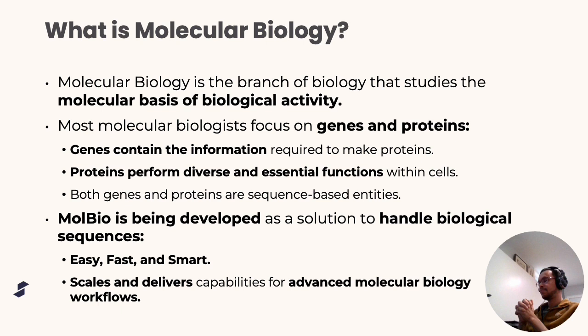Now, both genes and proteins are sequence-based entities, and as such, information is contained at the sequence level. So knowing this, we've developed Molbio with a few things in mind: easy, fast, and smart. What we mean by that is we've adopted a design philosophy to make the UI as intuitive as possible so that end users do not need much training and can get onboarded quickly. We want the software to be fast, so it's responsive and it saves you time with your complex workflows.